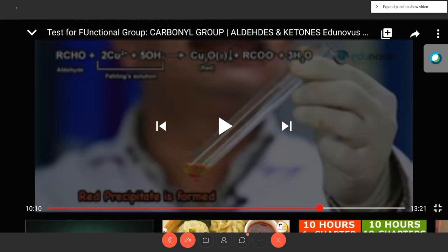The previous test was Tollens' reagent, that is alkaline silver nitrate solution, and we get a silver mirror because of the precipitate of Ag from the solution, and it gives a shiny mirror-type reflection in the test tube. That is why it is called the silver mirror test, and it is also given positive by aldehyde, not by ketone.